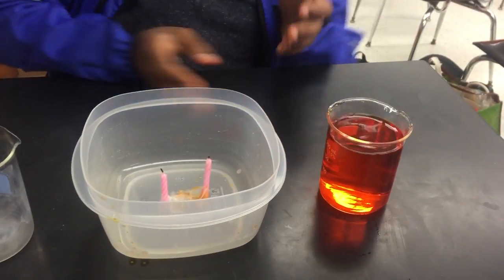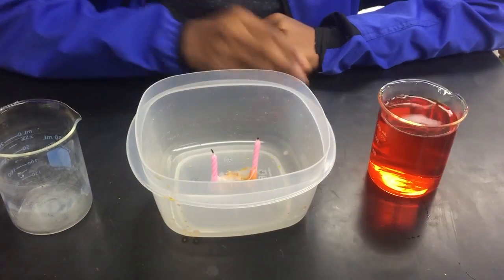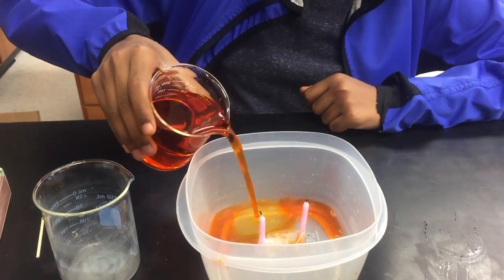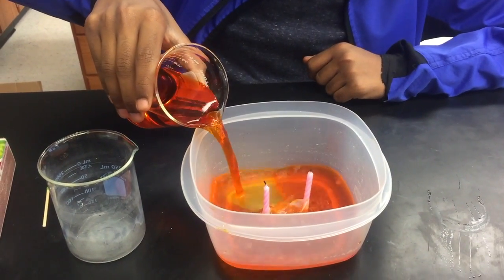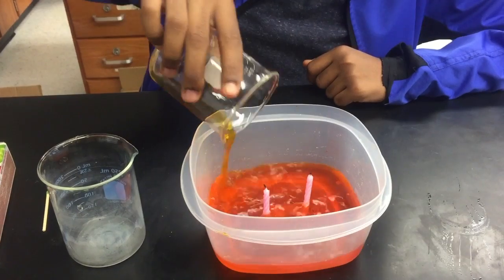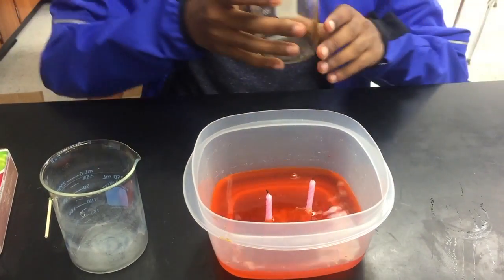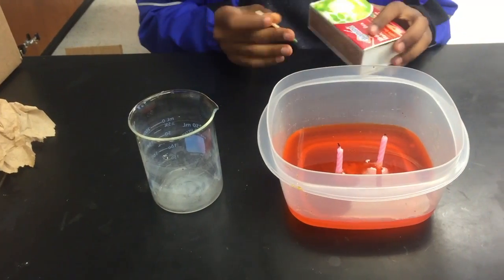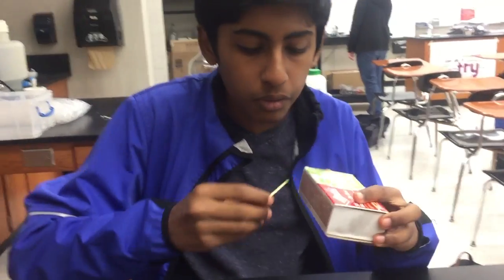that was burned. Okay, so first we have a box with 2 candles attached to the bottom with tape. And we're going to be pouring water with food coloring into the box, enough so that when you place the beaker over the candles, the bottom of the beaker is fully submerged. Okay, so for the first shot, we're only going to be lighting one of the candles to see how much water is going to rise when that one candle goes out.